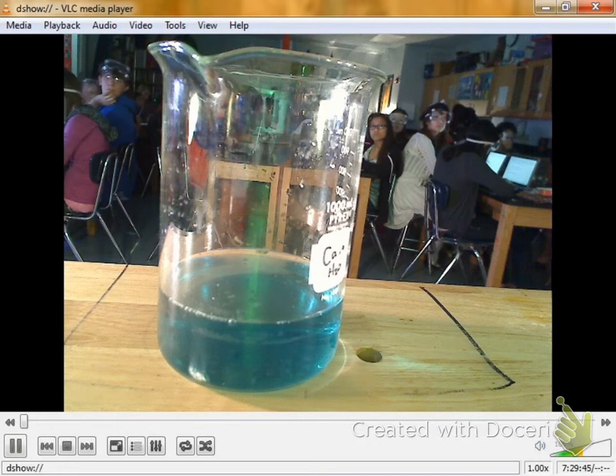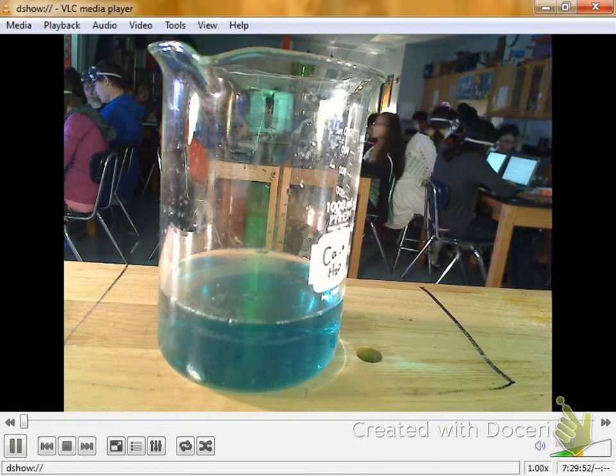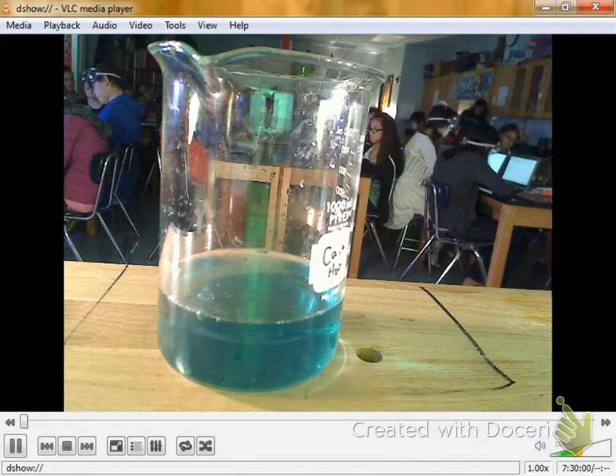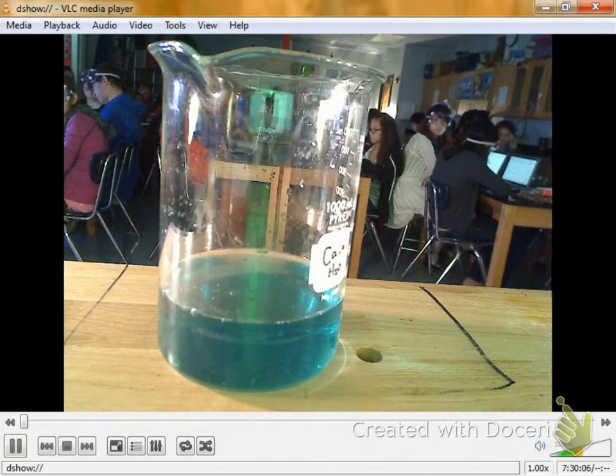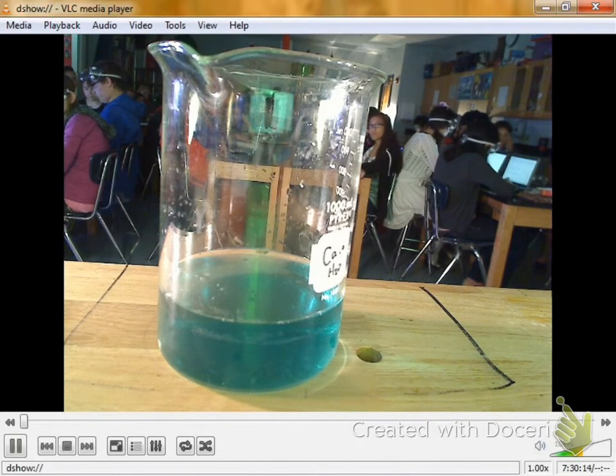So would you say that calcium in the water was a little more reactive than the magnesium? Yeah, definitely more reactive in the water. It was more reactive in the hydrochloric acid too. I'm just not really sure exactly why it didn't bubble up, because all day long it's been making bubbles right away. I'm going to blame it on the camera, because it's a good camera, but it's supposed to be recording pretty well, but yeah, it's got a little bit slower focus or something.